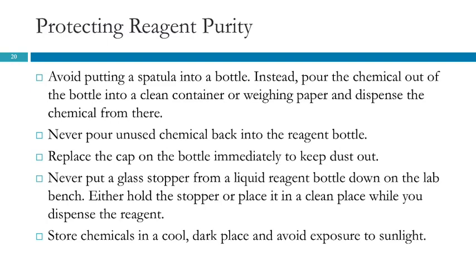And then we want to store chemicals in a cool, dark place and avoid exposure to sunlight. Some things are especially sensitive to light, and so those are stored in amber bottles, but all chemicals should be stored in a cool, dark place.